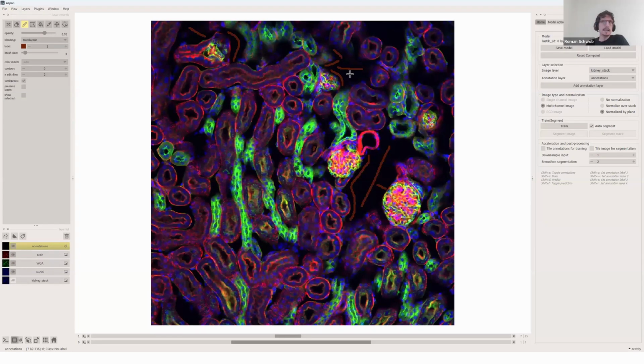Now let's maybe add these knots. I'm not a kidney expert, so bear with me if I'm using strange nomenclature, but I'll just call those knots. So it's these structures here where we have basically all the information or all the signals clamped together.